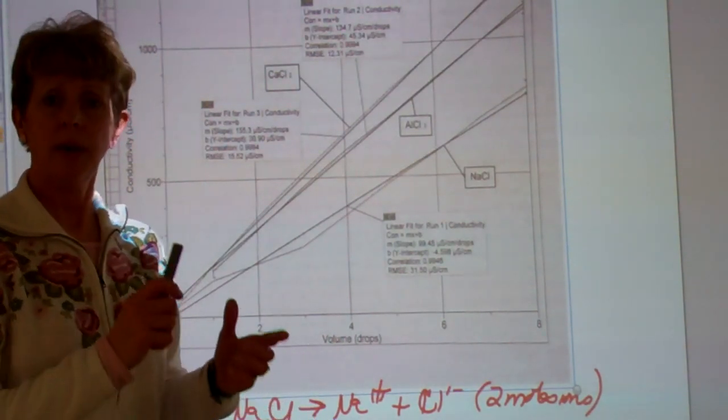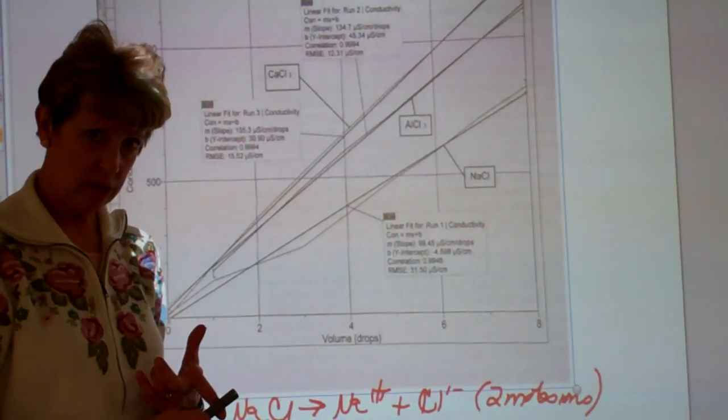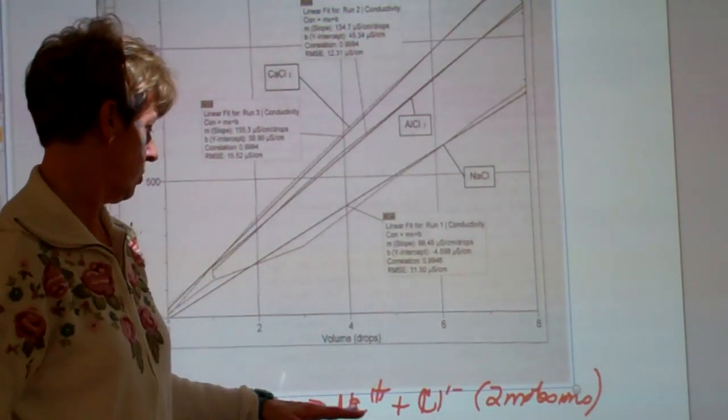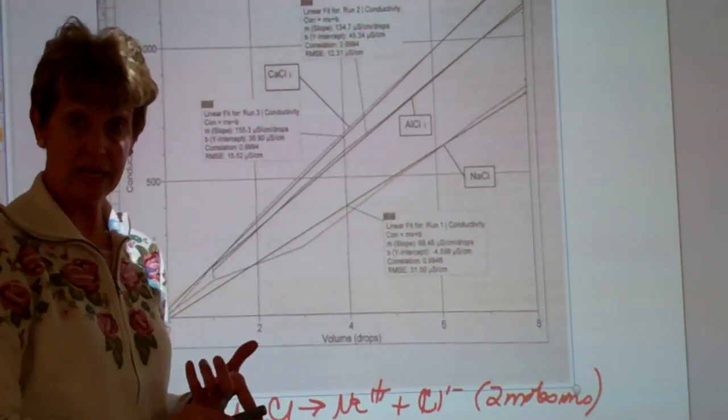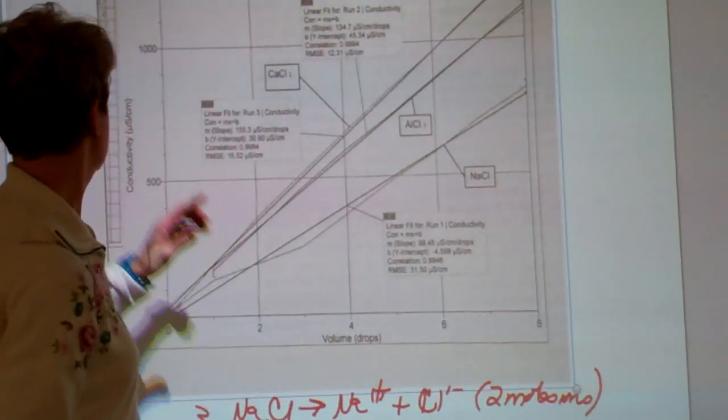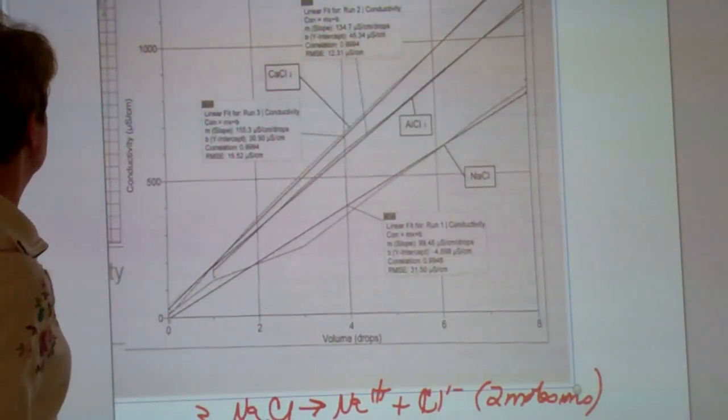That should be ready to be handed in after you do a reflection, and again, you're handwriting this one right in your lab manual. You're going to restate your purposes, and calculate percent error based on one of these values.